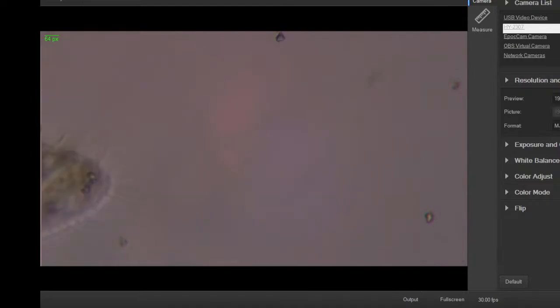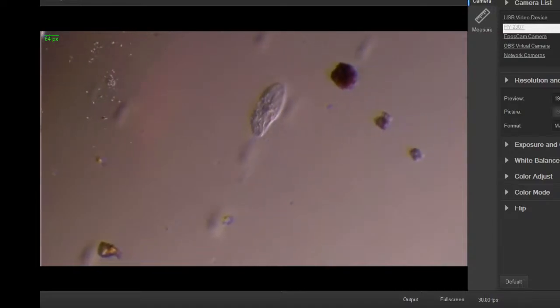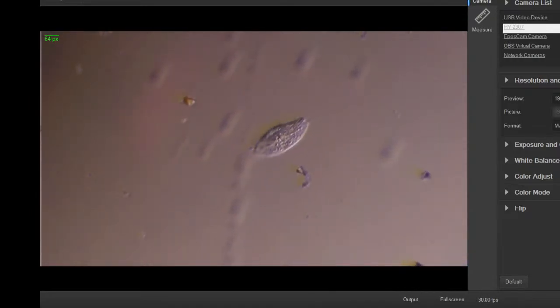Boy, it's really moving now. I'm gonna have to go to lower power. You guys are gonna get seasick from this. He wins. The little guy wins. Let's keep him on lower power. It's much easier to follow now, at least, so I don't have to turn so much. Crazy jerking swimming motion.